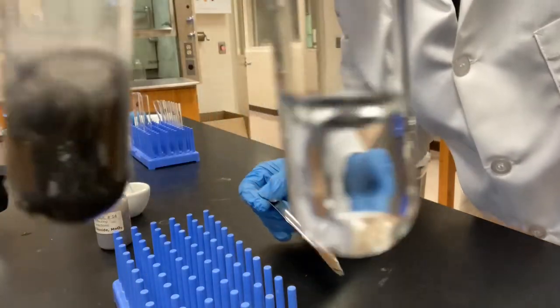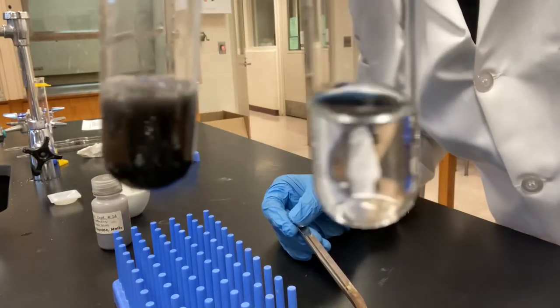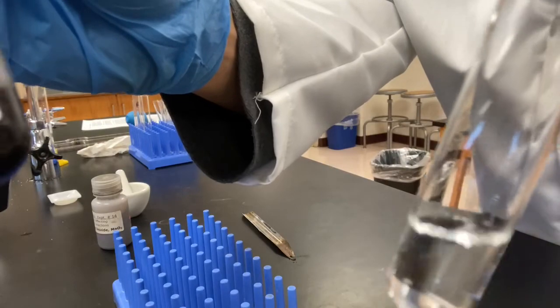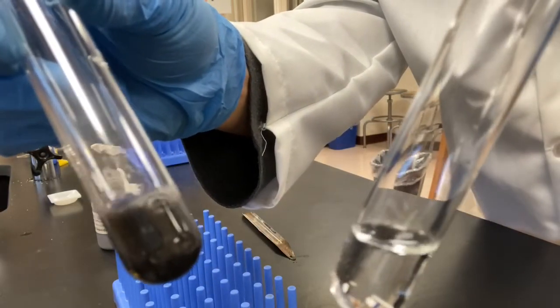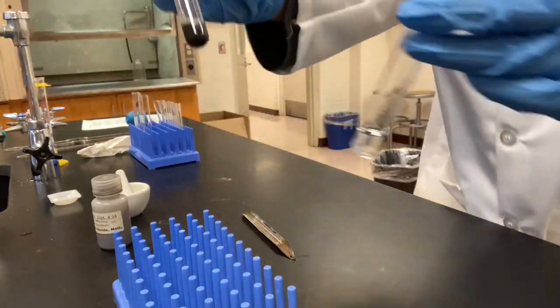Look at that. Look at the bubbles coming out from it. Okay? Now it's the difference. With the catalyst, hydrogen peroxide decomposes very fast. You see, now it is done. There's no bubbles anymore. All the hydrogen peroxide has decomposed. All right? Without a catalyst, with a catalyst.